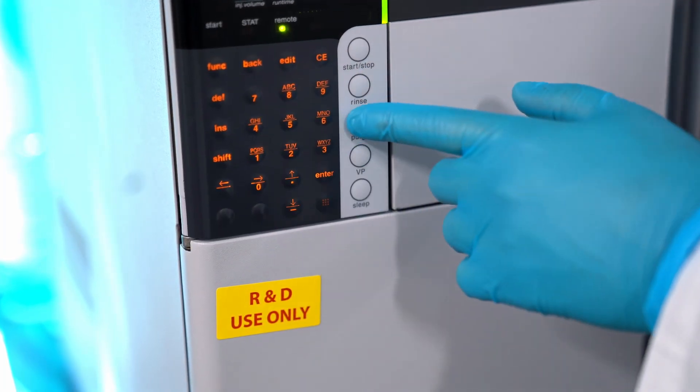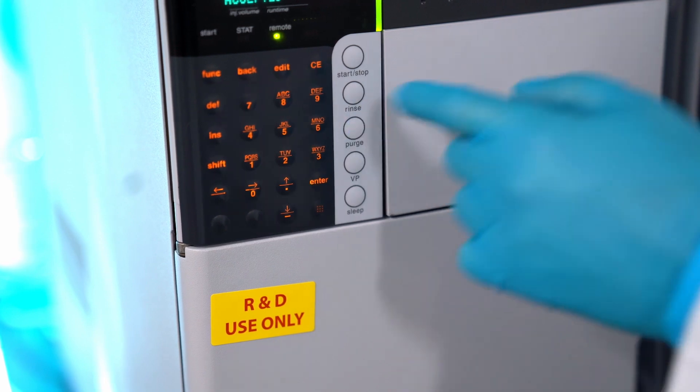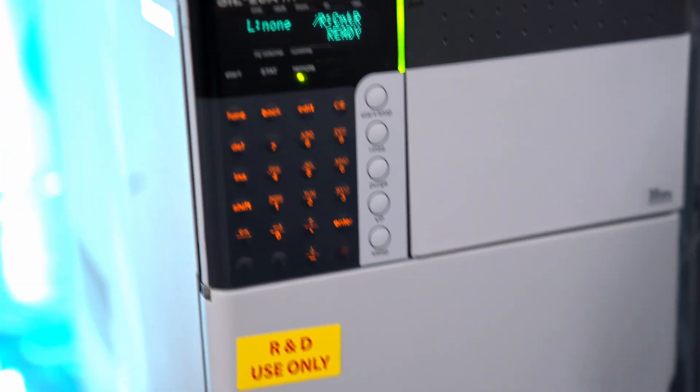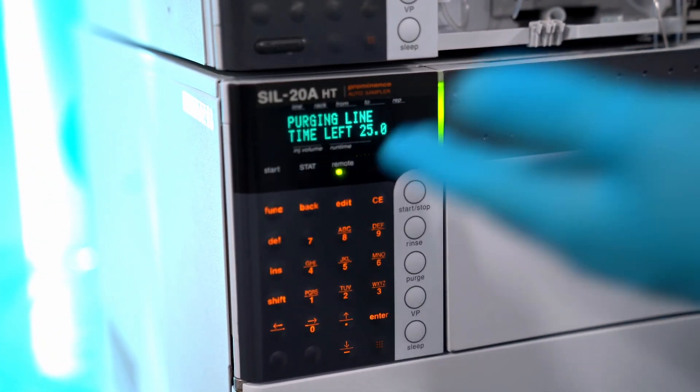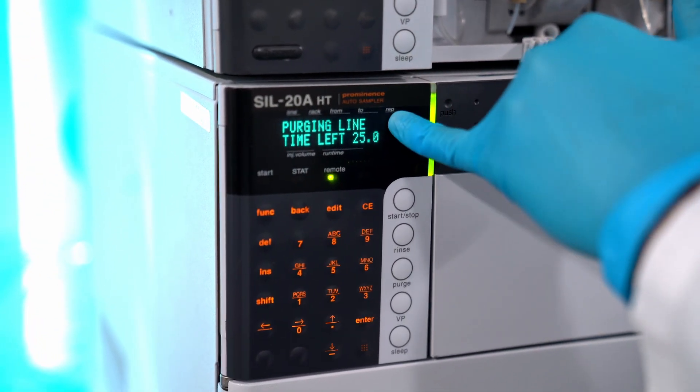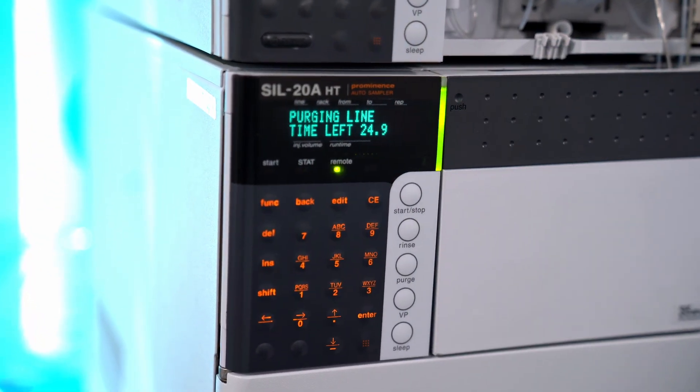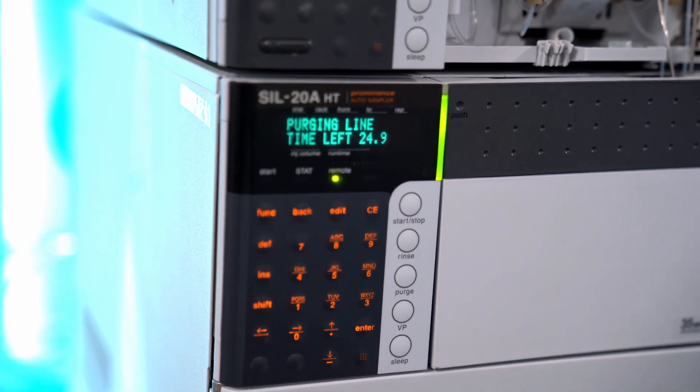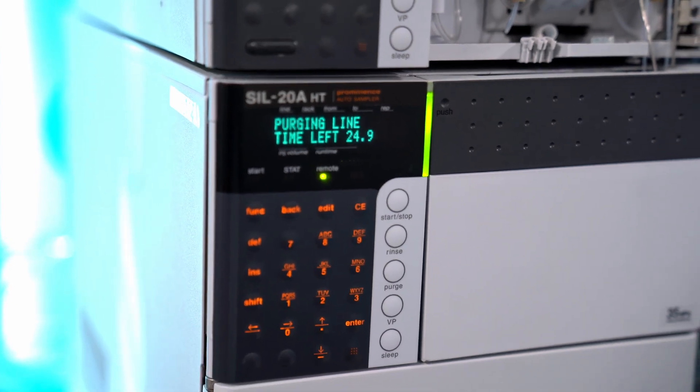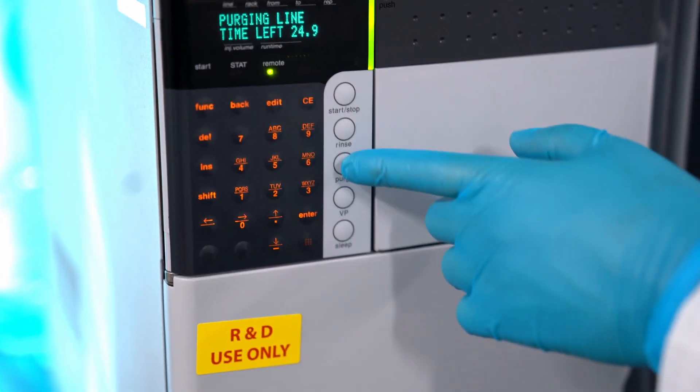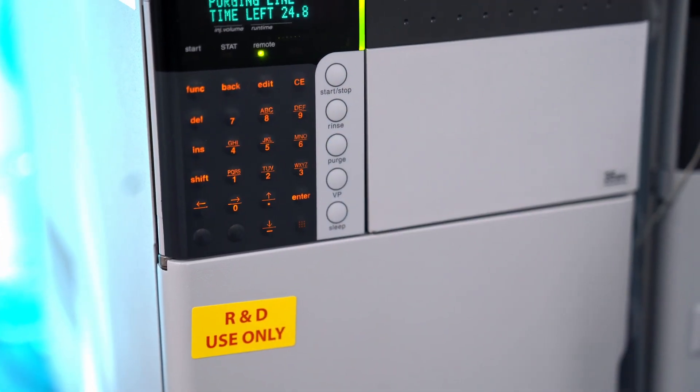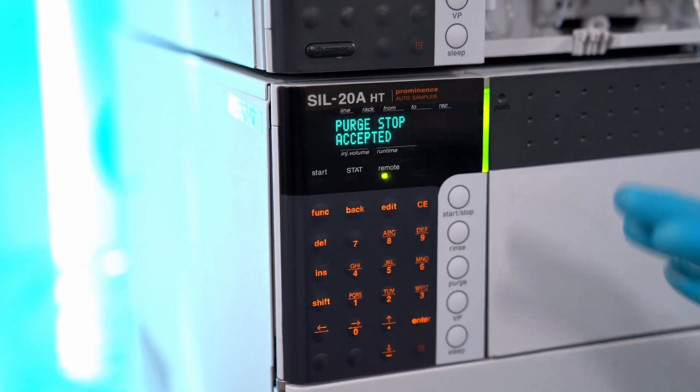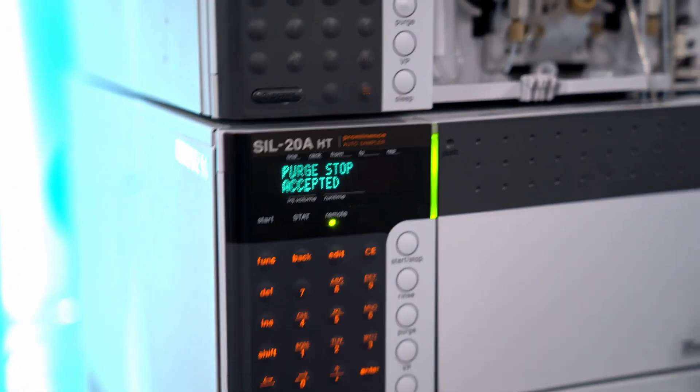If you want to start the purge you just hit this and it'll tell you how many minutes it has left to purge. And if you want to stop the purge you can just hit this guy over here. That's how you purge manually.